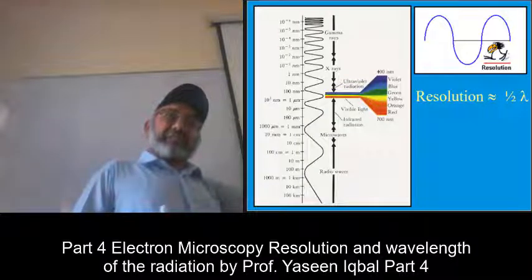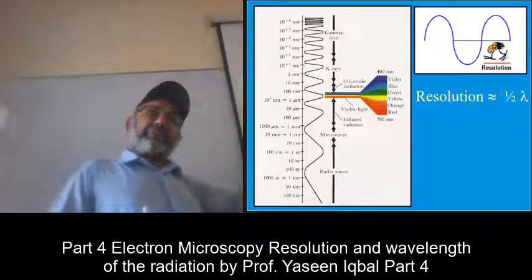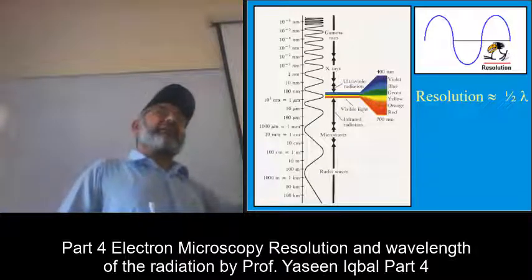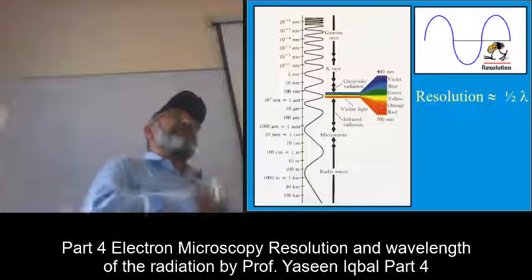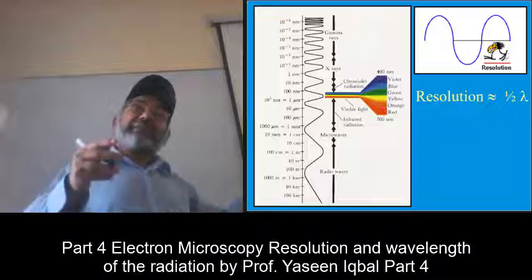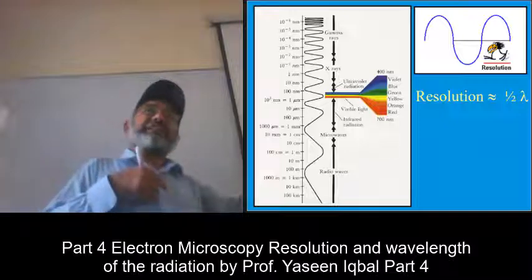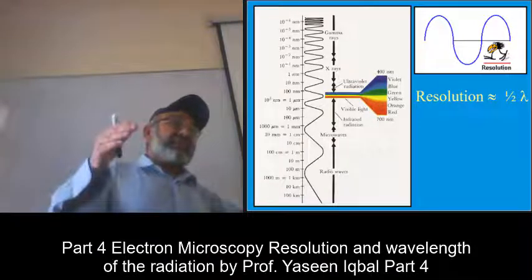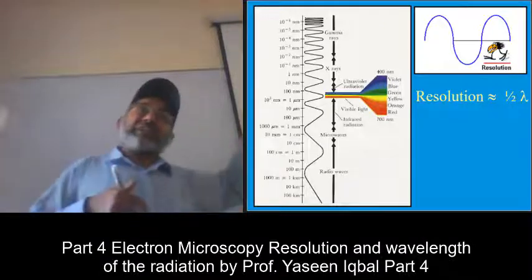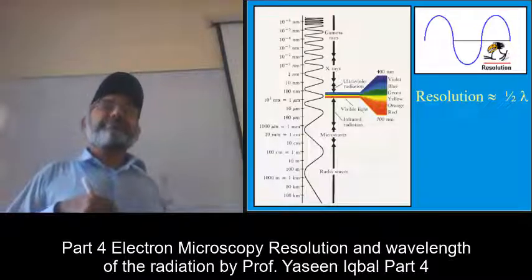When you talk about the defects in crystals and stresses in crystal, if there is a stress in the plane, then the diffraction from that plane will be different from the one which is not under stress. The stress will a little bit widen the gap between planes, or it will shrink. When one region is under stress, then the other region will be under strain automatically. And that will give you variation in the interplanar spacings, and you will be able to measure the stresses inside a material.